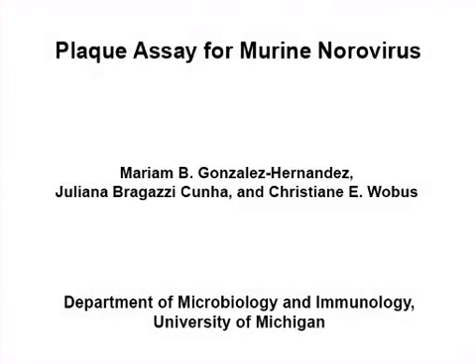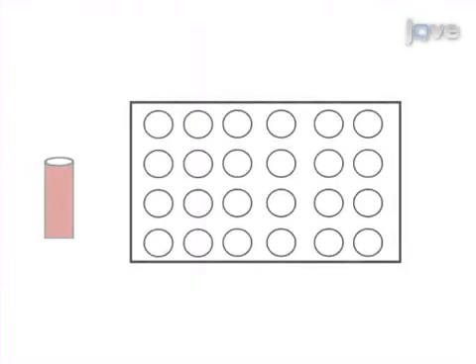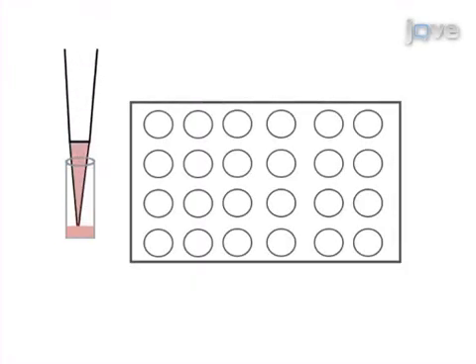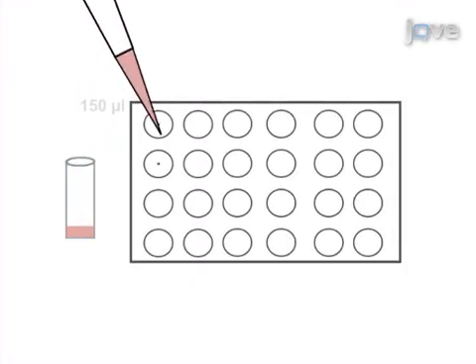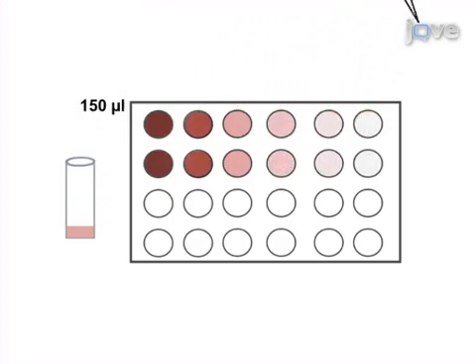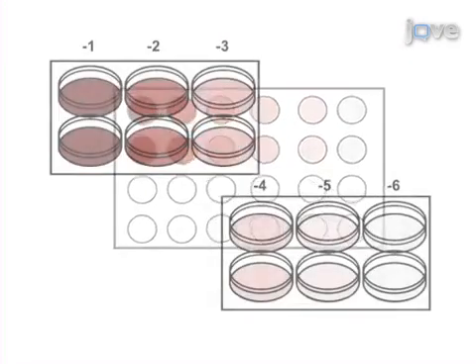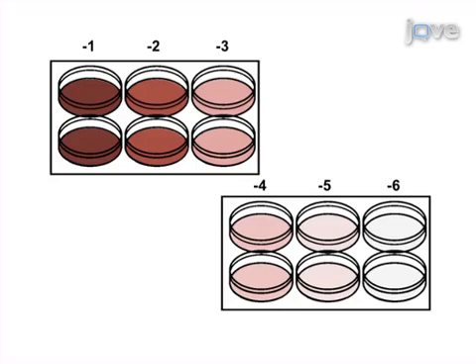The overall goal of this procedure is to quantify infectious murine norovirus particles. This is accomplished by first preparing tenfold dilutions of virus inoculum. The second step is to transfer dilutions of virus inoculum to a RAW 264.7 monolayer and incubate plates rocking at room temperature for one hour.